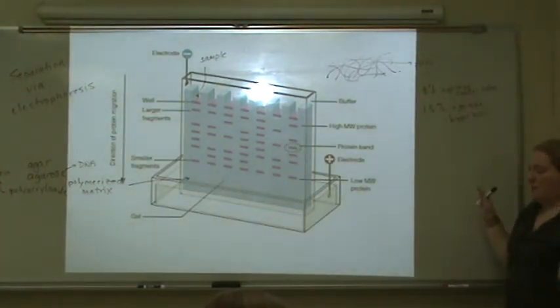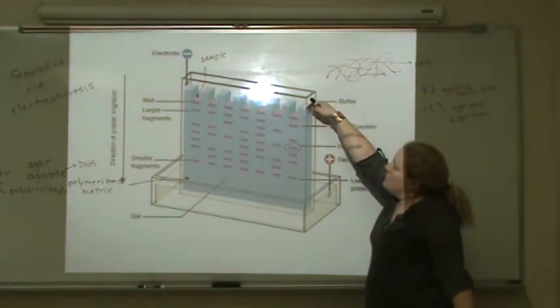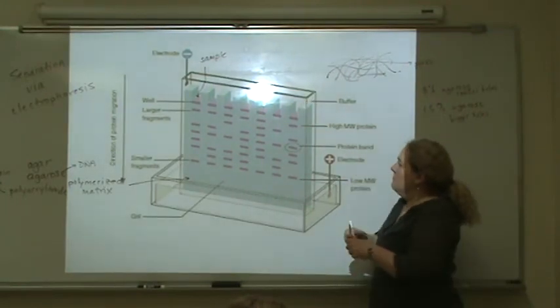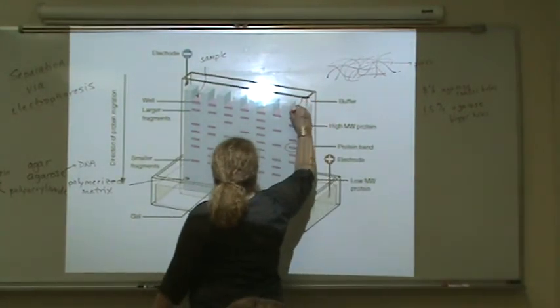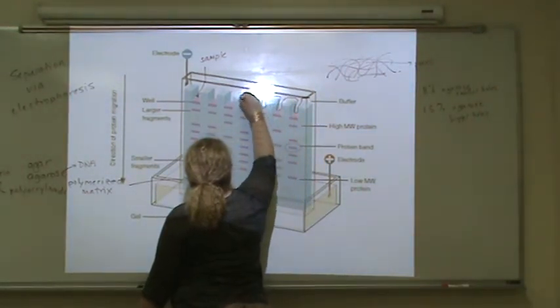And so you form this mesh, or this maze almost, that will hold its shape, and you can use forms. Usually they take the form of some kind of plastic comb.